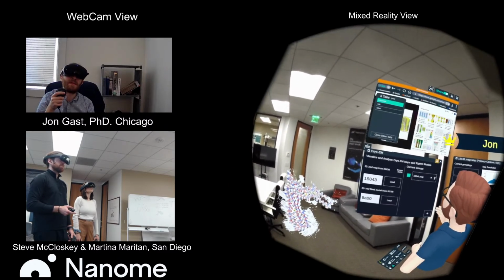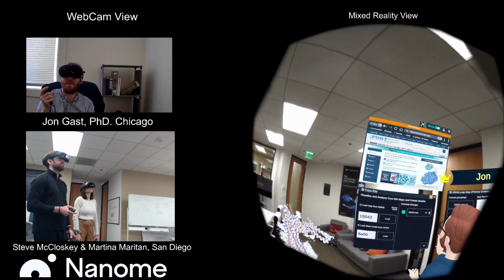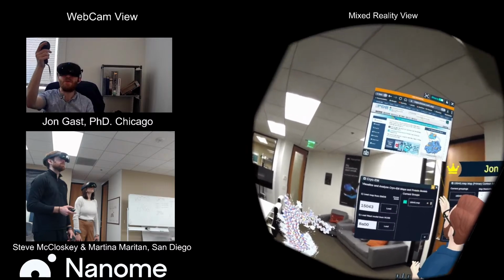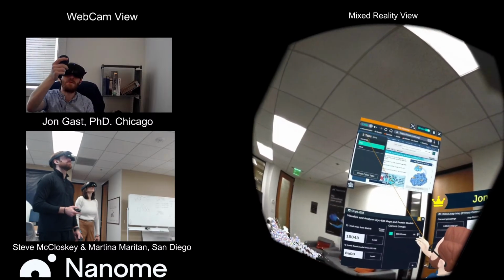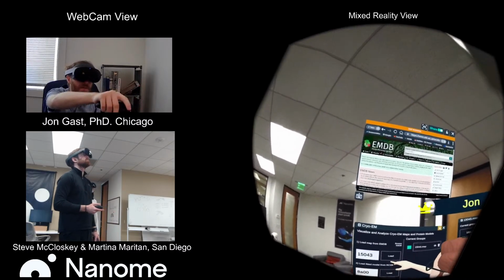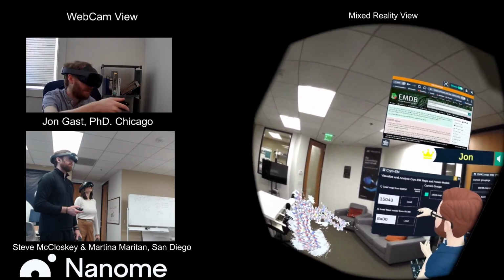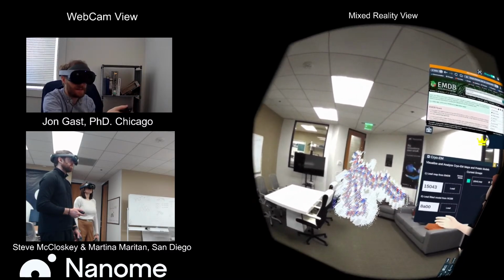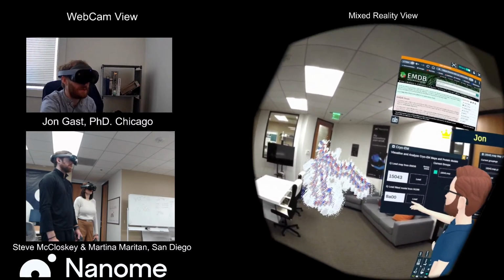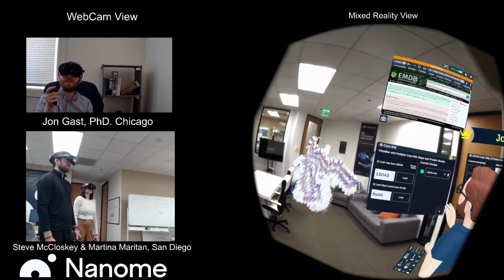One place where we can look that up, and this is literally what I did because I was curious about prions and different fibrils, is to search within RCSB or alternatively within EMDB for a map to identify the number. Then all we did from here was click load, and our map came in here in white. And then Nanome automatically filled in the PDB value that was associated with it. So it's an easy way to bring it in.